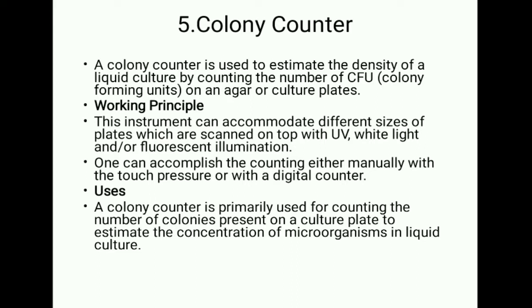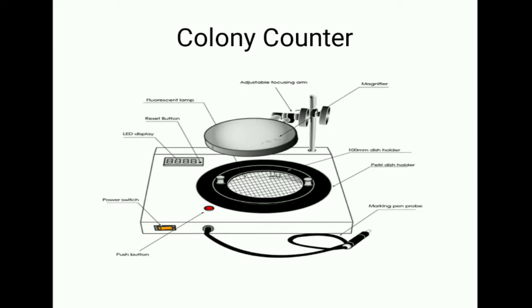Talking about use, a colony counter is primarily used for counting the number of colonies present on the culture plate to estimate the concentration of the microorganism in liquid culture. So this is the colony counter.